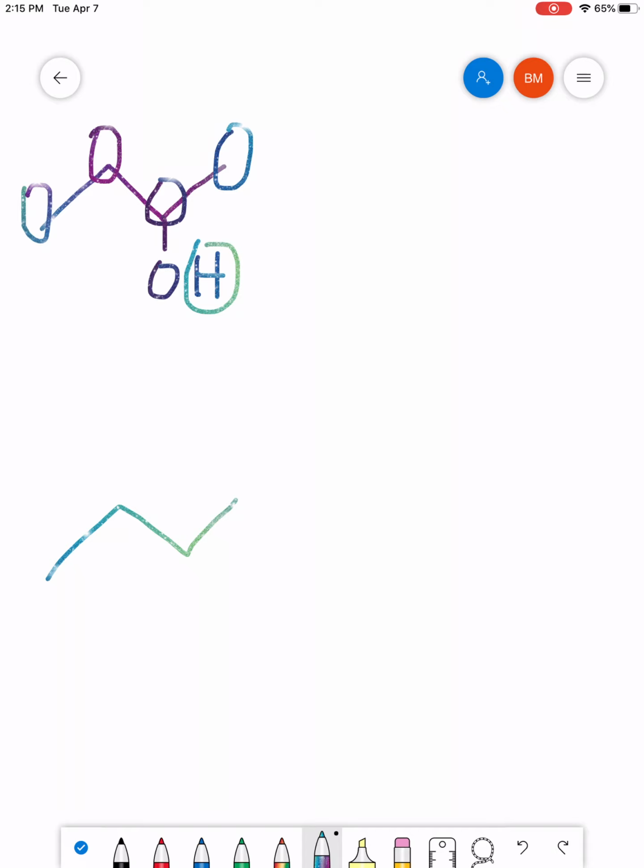And if you look at all these, each one of the groups I've circled, if you get in the position of the hydrogen and try to see what your environment is, I think you can safely say that each one of these 5 groups would see a different environment. They would have different neighbors. So this one, we can see, would definitely produce a more complex spectrum. This one would have 5 signals.